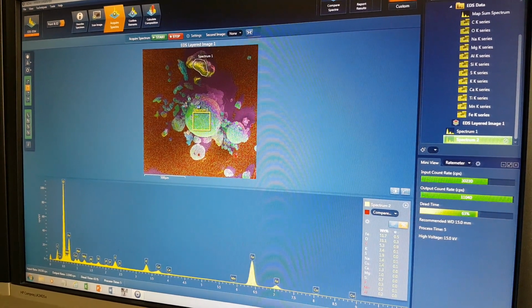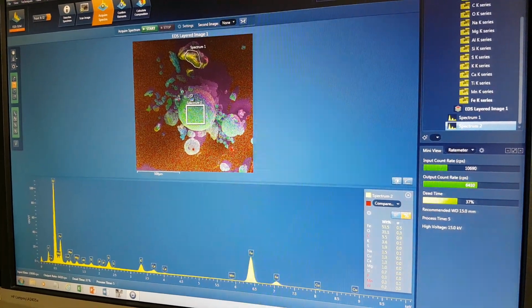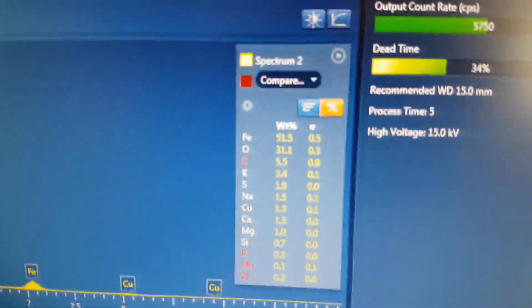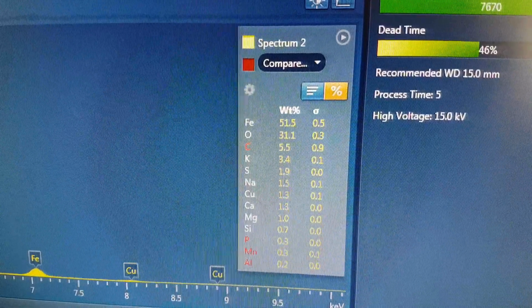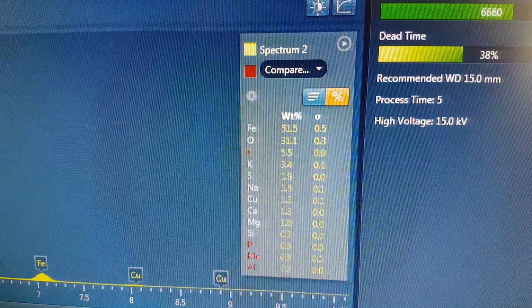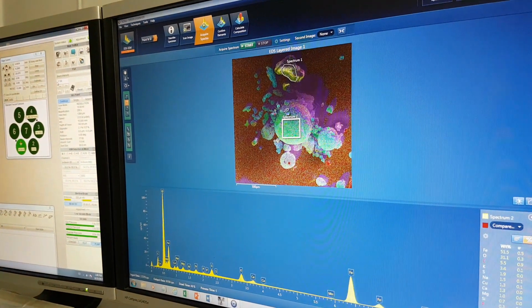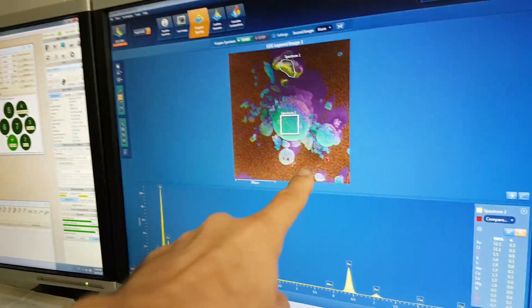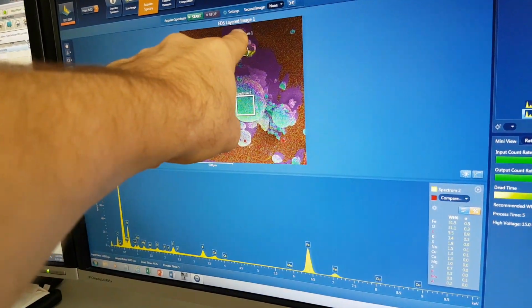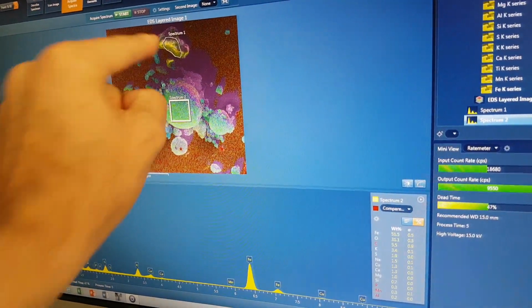And it's doing the samples now. So George, congratulations. I'll hold my judgment until we can run some 5-9s carbon. The 5-9s carbon would be very important to test. We will make some spectrum from other place. I think we should probably go and look at the wood areas now. Yeah, elsewhere. Can we go and have a much closer look at the iron and the silica and just do some SEM images much closer? So go right in, high magnification on this and this. Yeah.